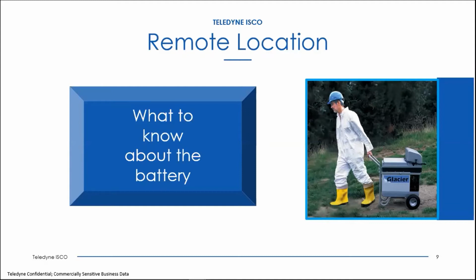There's also the bigger deep cycle marine battery, which is a lead acid battery, but it's like a big car battery that you can use. A lot of times with portable glacier sampling, they'll use those big deep cycle marine batteries. They're about a 100 amp hour battery. You can find those locally anywhere. It's a very common battery, very common for people to use at remote sites, like solar powered sites or just any remote sites.